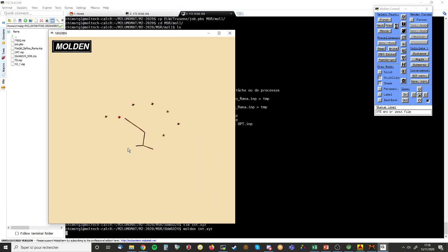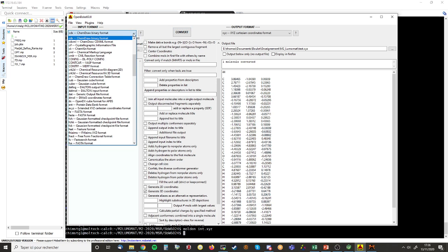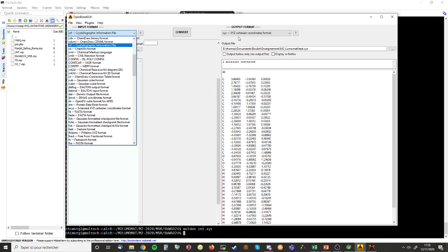No, it's not correct. You only have the atoms that are independent by the symmetry. So I'm not sure. Here, when we do CIF, crystallographic.